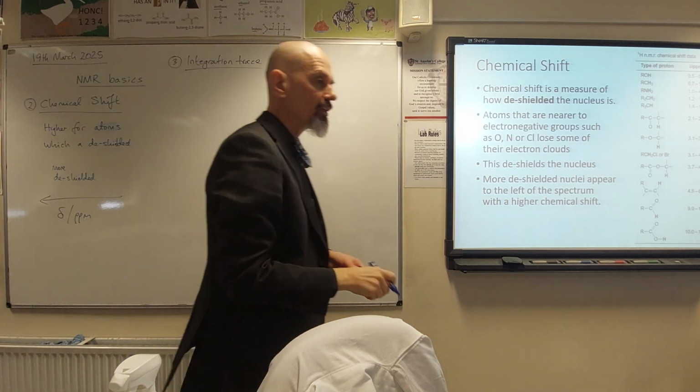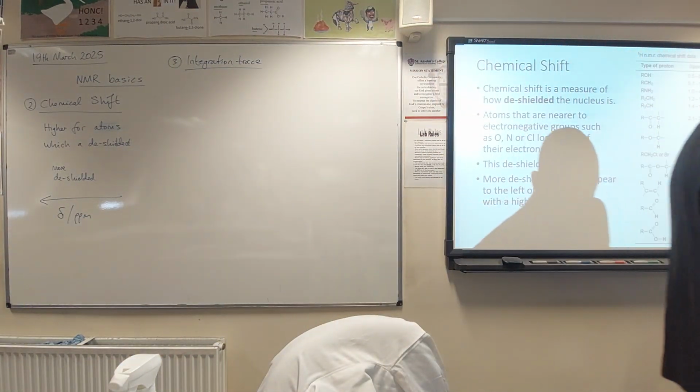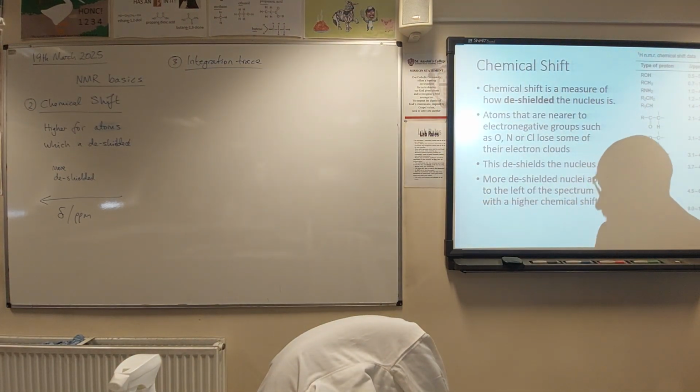Okay. The third important bit of information we're going to get from our NMR data, and this is just for proton NMR now.